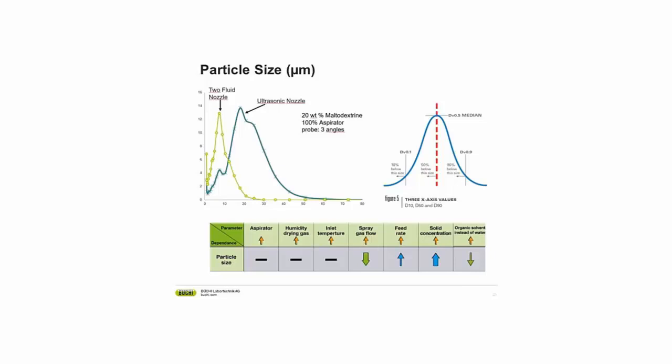However, it is very, very hard to understand and optimize your process on a pilot scale. And really, this is where we come in with the lab scale. Everything that works on a lab scale is quite easily scalable to pilot scale.